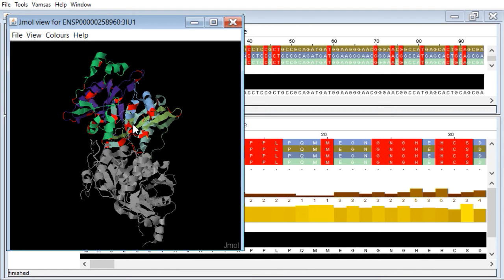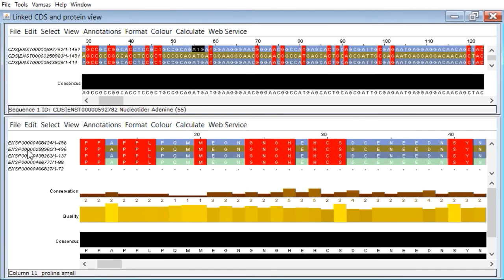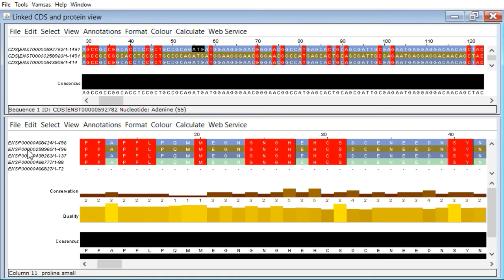You can see the colors actually map through. So where it's blue, green and so on, that matches back here where we've got the exons for that particular sequence.